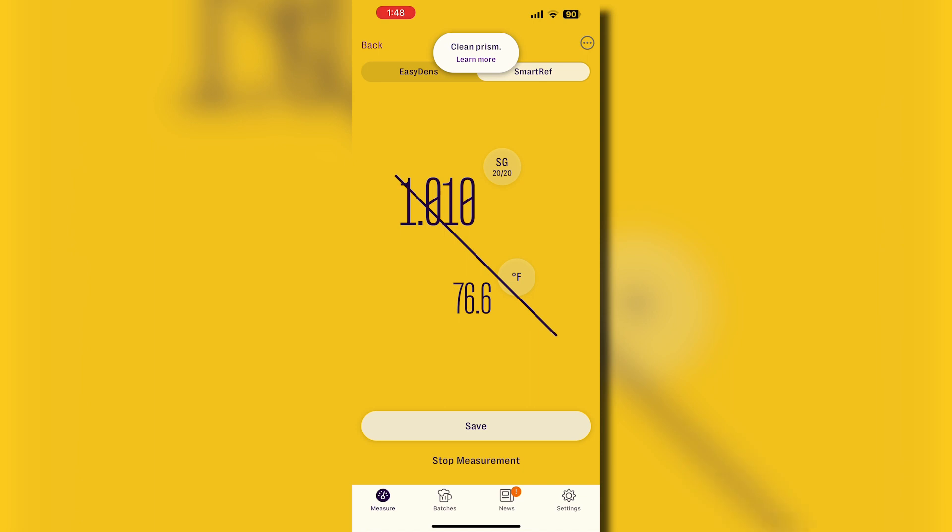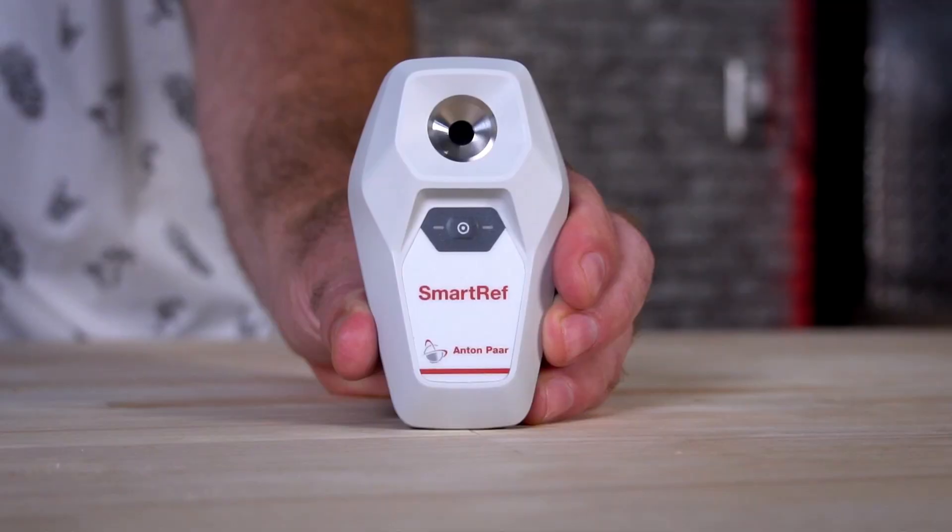What I love about it is it's super easy to read. If you've ever looked through a refractometer, trying to see where that blue and white part is and squinting and making sure you have the right light source — as you get older, it's nice to have it right there on my screen. Also it does alcohol correction. Usually refractometers you can't use them on the cold side, but having the original measurement stored in here, it does that calculation for you — that's really handy to have built in.